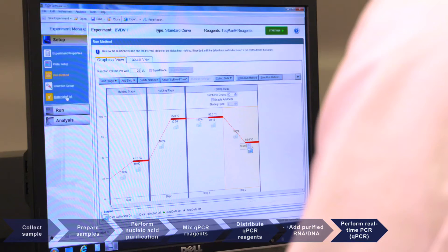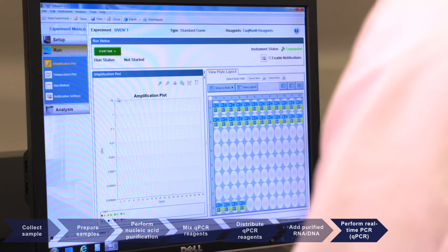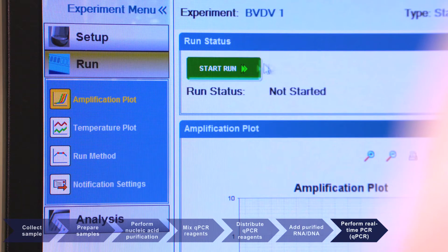Run the thermal cycler and analyze the RT-PCR data according to the instrument manufacturer's instructions.